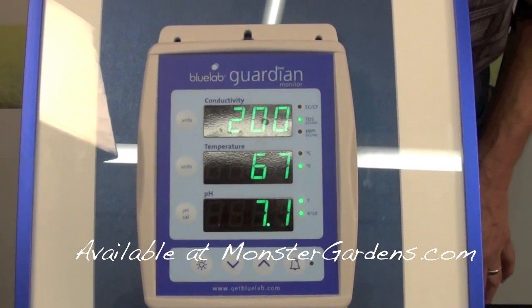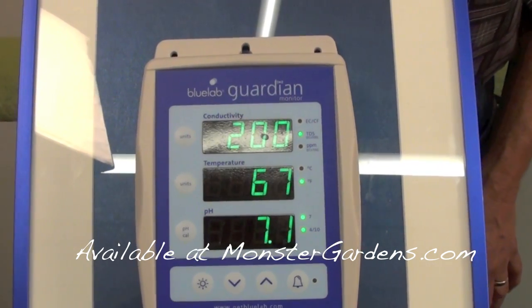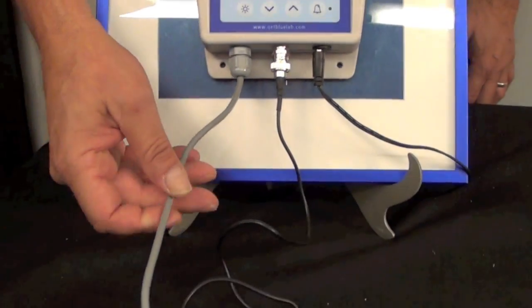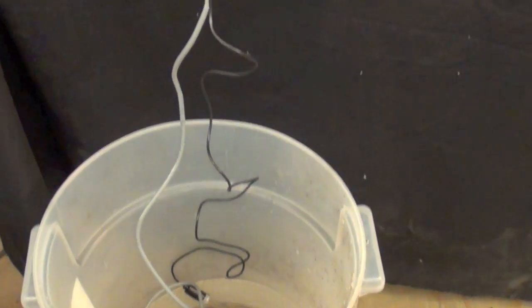This is the only combo meter I've seen that has these features. We also coat the conductivity cord so that you don't have any interference from ballasts that give digital reads.